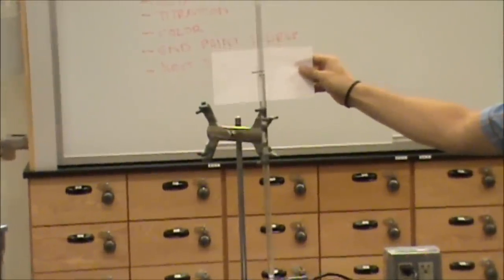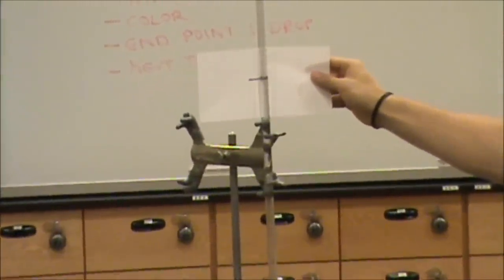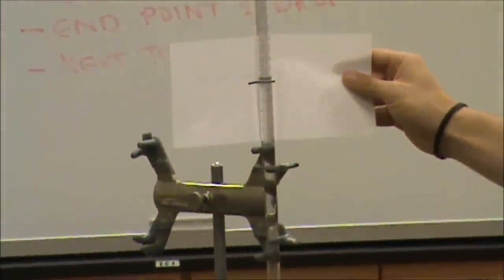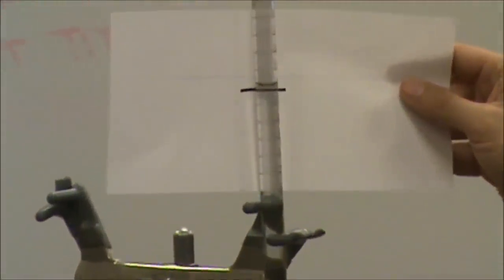I am once again going to use the piece of paper with the black line to measure from the bottom of the meniscus. We want to record this volume to two decimal places. And I believe we are at 13.95 milliliters.